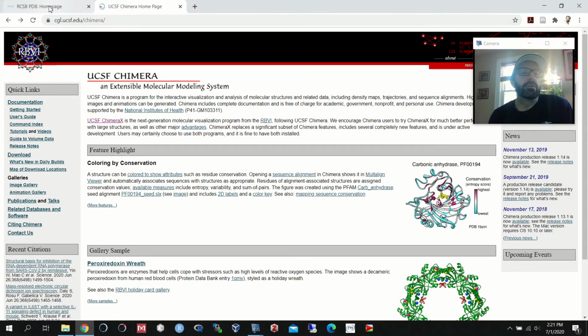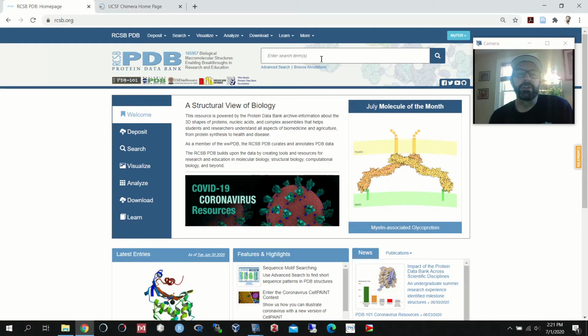So back to talking about analyzing proteins and protein structures. You're going to want to install Chimera, and I'll show you that in a minute. Protein Databank, this is where we go to find our structures. So for instance, if I wanted to look up my BRAF and sorafenib, I could do a keyword search here and look for a structure of that. Is there a structure of that drug bound to that? I actually already know the PDB ID for that, so I don't necessarily need to do a search, but I can pull it up here.